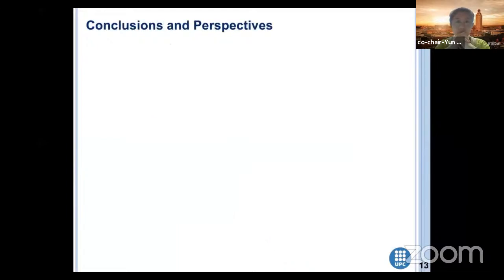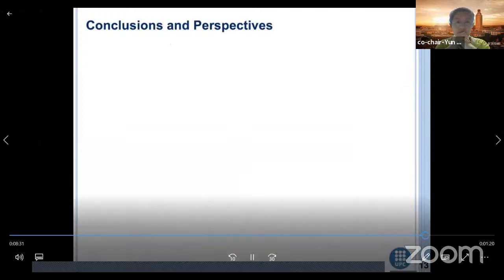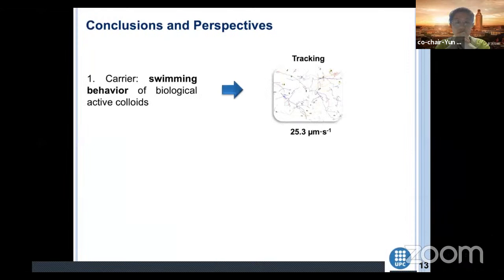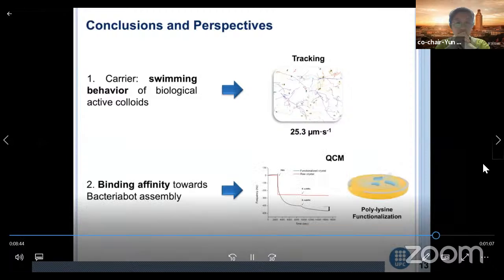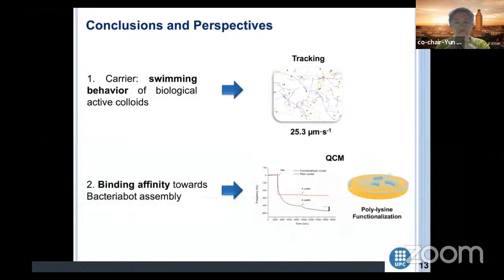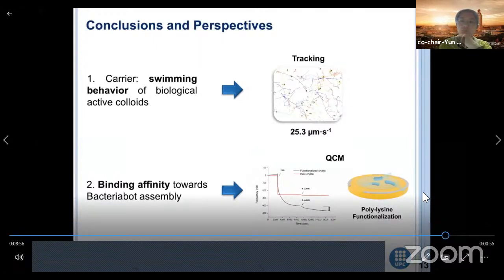Overall, the conclusions and perspectives of this work, let's say take-home messages, are, for example, the carrier characterization implies the swimming behavior that we did with optical microscopy to obtain the best conditions for the binding assays. This binding affinity can be screened with a quartz crystal microbalance approach, and then new approaches and functionalities can be tested in this sense by this technique.